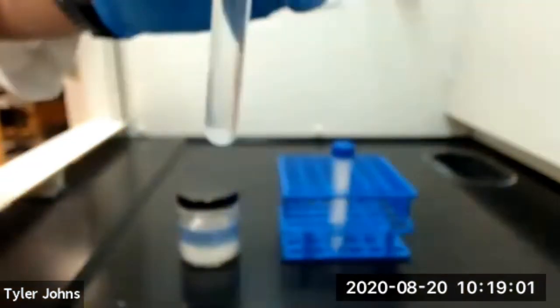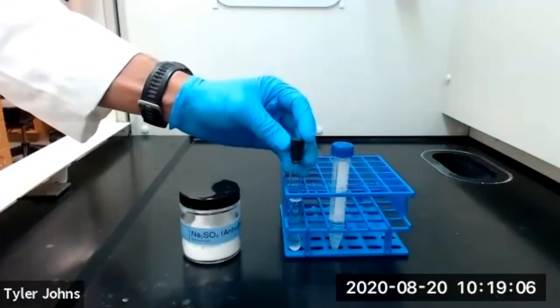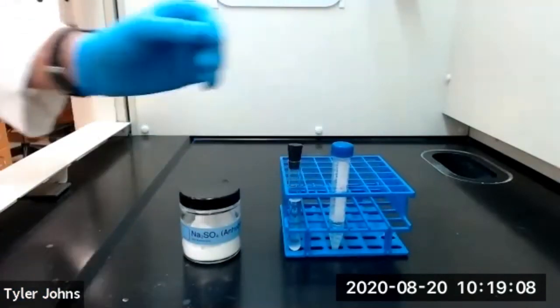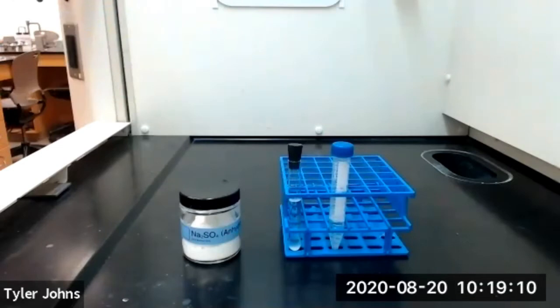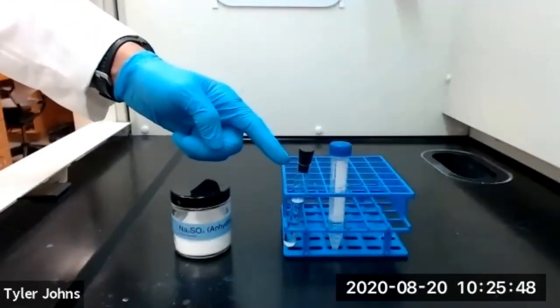We'll now set our test tube in the rack and stopper it and allow it to continue drying for a period of about 10 to 15 minutes. While our methylene chloride solution continues to dry, we need to pre-weigh a 10 milliliter Erlenmeyer flask.